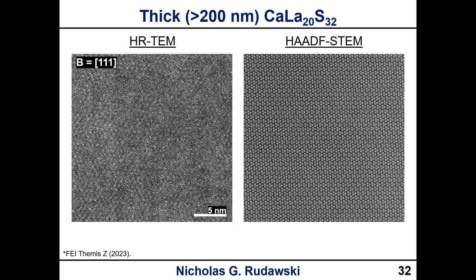And now to be clear, your HAADF-STEM images will be improved as the sample gets thinner, okay? But the point of this, though, is that even in a quite thick sample, okay, HAADF-STEM can still be effective, right?